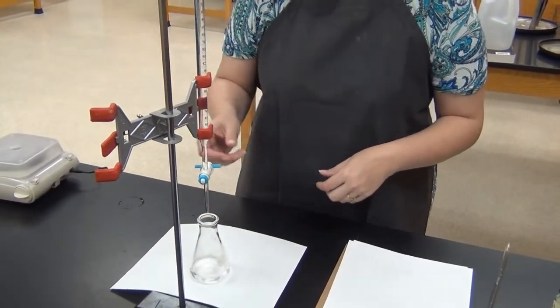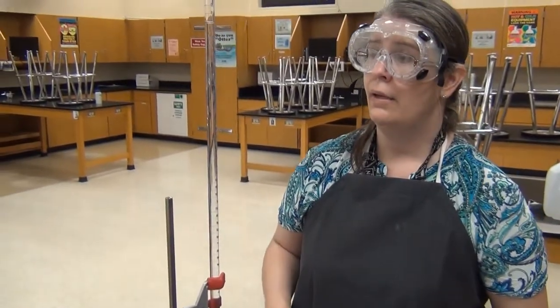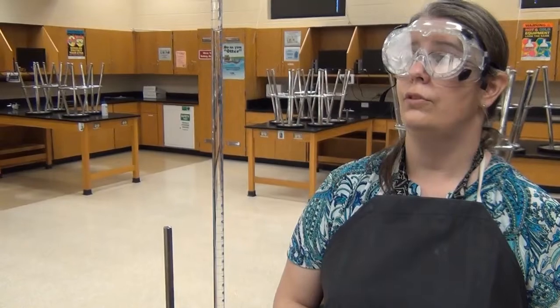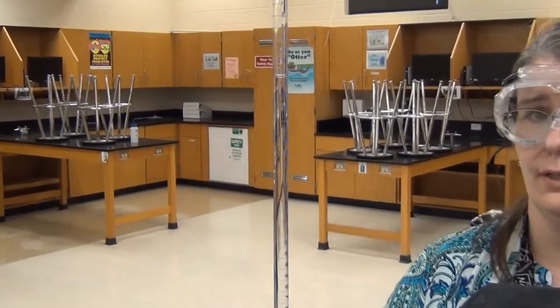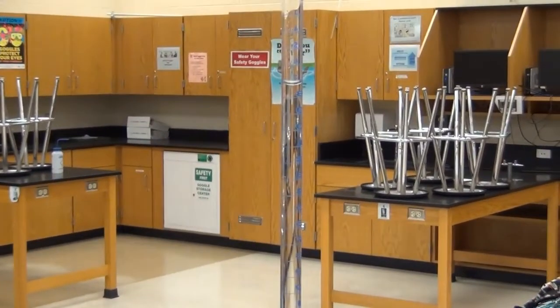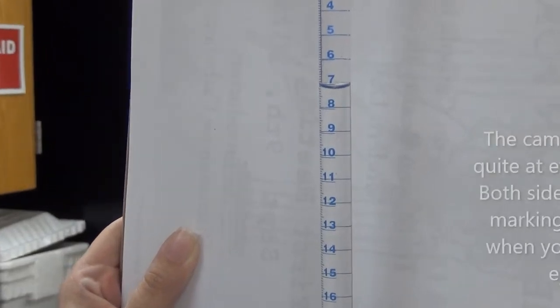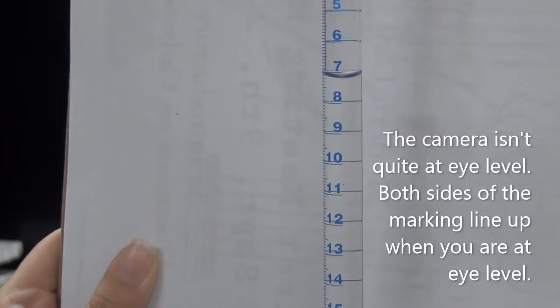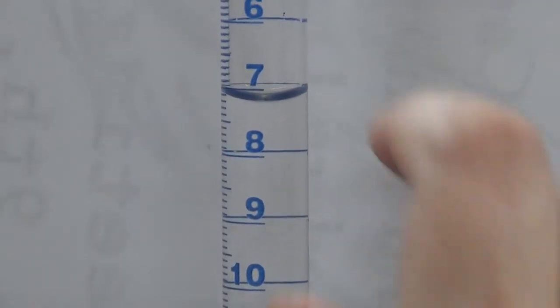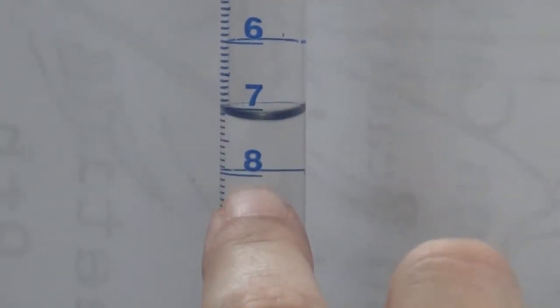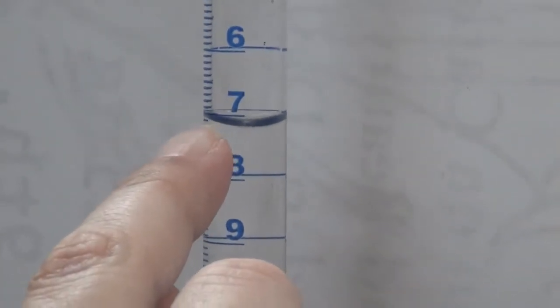Alright, so now we can start the titration, but we need to make sure we write down our initial volume of sodium hydroxide solution. I'm going to measure my starting volume of sodium hydroxide. I put some more into the burette so that we would have plenty for the titration, and again I'm in between the seven and eight milliliter lines, so I'm going to count down the tenths.